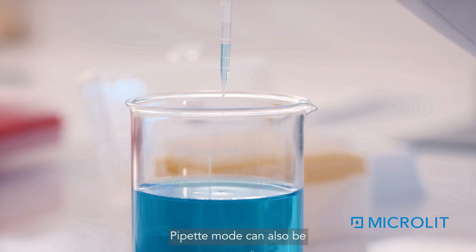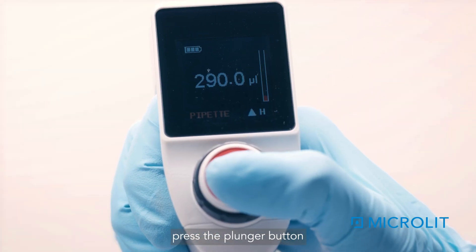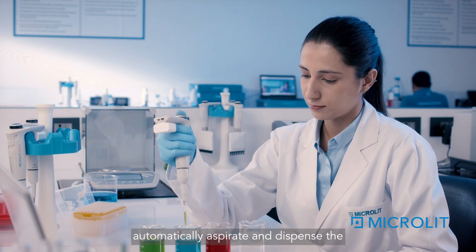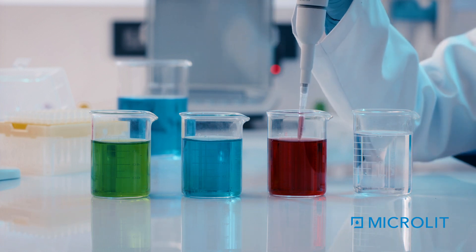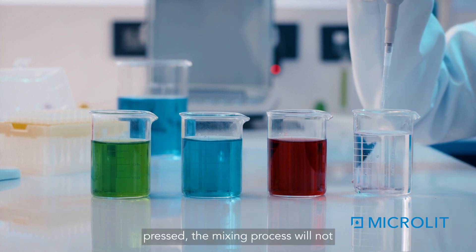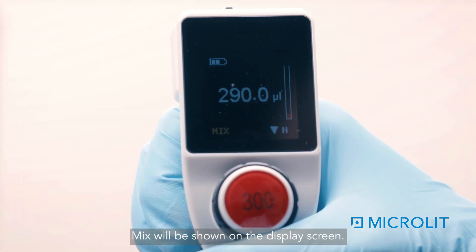Pipette Mode can also be used to mix liquids. After setting the volume, press the plunger button to aspirate. Then long-press the plunger button to automatically aspirate and dispense the liquid five times to complete the mixing. Until the plunger button is long-pressed, the mixing process will not start and will be on hold. 'Mix' will be shown on the display screen.